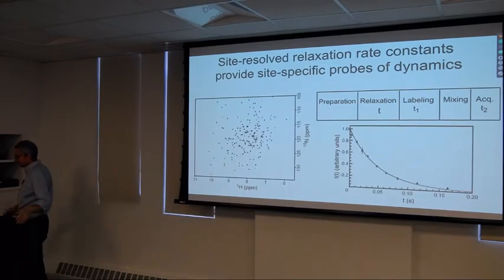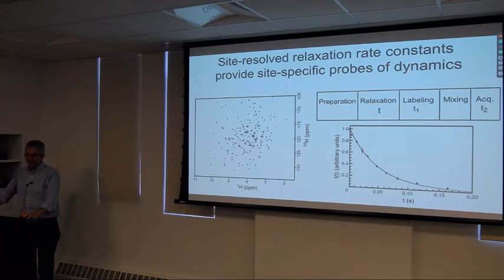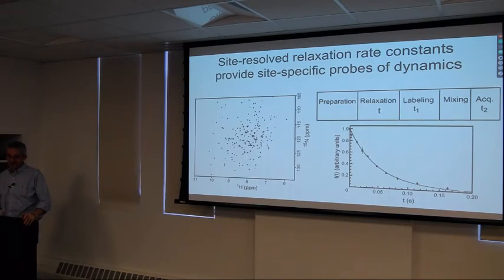Dave Case, who is a professor at Rutgers, is a theoretical chemist who works a lot in NMR, likes to tell me that NMR spectroscopists go to great lengths to design complicated experiments in order to obtain data that's simple to analyze, whereas a computational chemist would do a simple experiment and then do a complicated analysis of the resulting data. So sometimes I think he might be right, but as you'll see, most of the experiments are going to be very complicated pulse sequences.